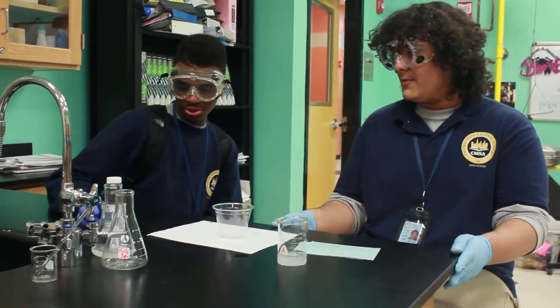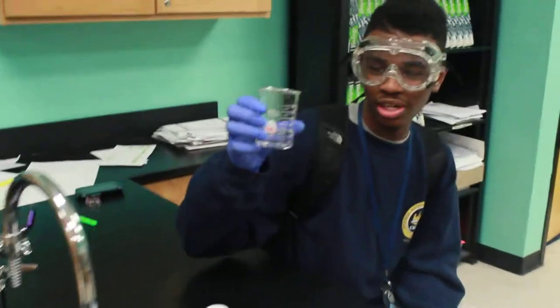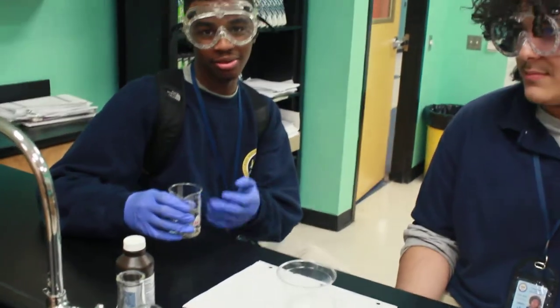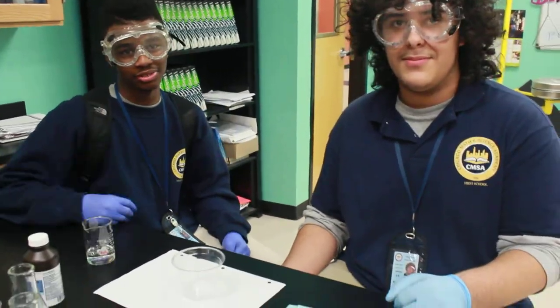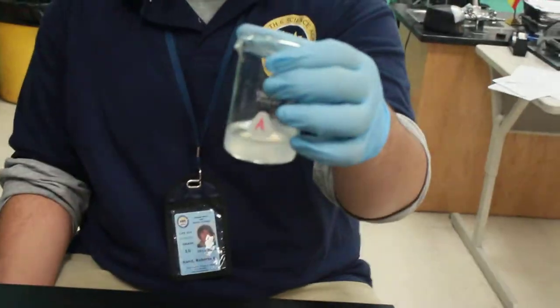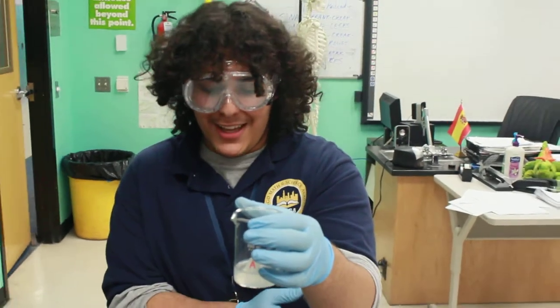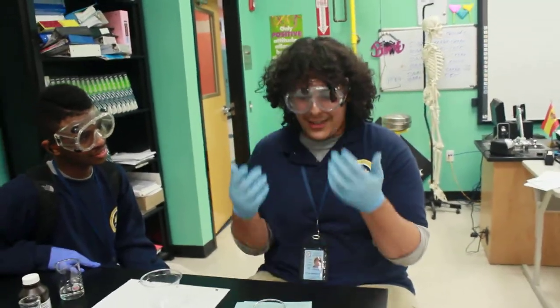First we're going to introduce what we have right now and this is hydrogen peroxide. You get this at your local pharmacies but it irritates your skin, that's why we're wearing goggles and gloves. And here is Solution A — in Solution A we have acetic acid or starch solution. We also have sodium acetate, sodium thiosulfate, and potassium iodide, which are all skin irritants so we wear gloves and goggles.